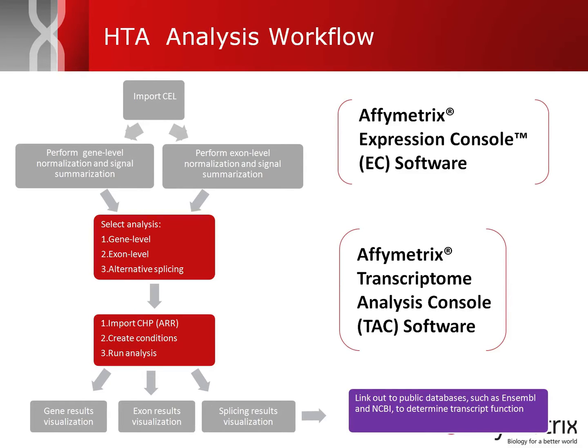The first is Expression Console. Expression Console is used to produce the signal summarizations, and second as a quality control reporting tool to evaluate the performance of the arrays.